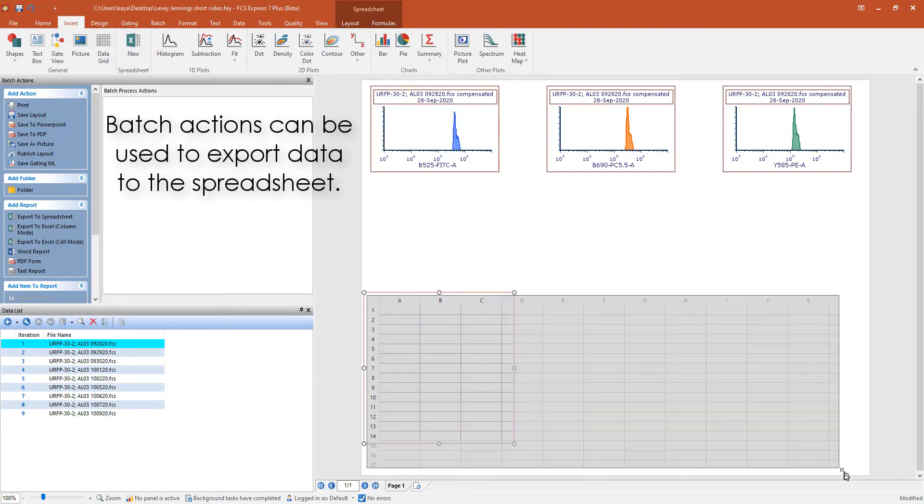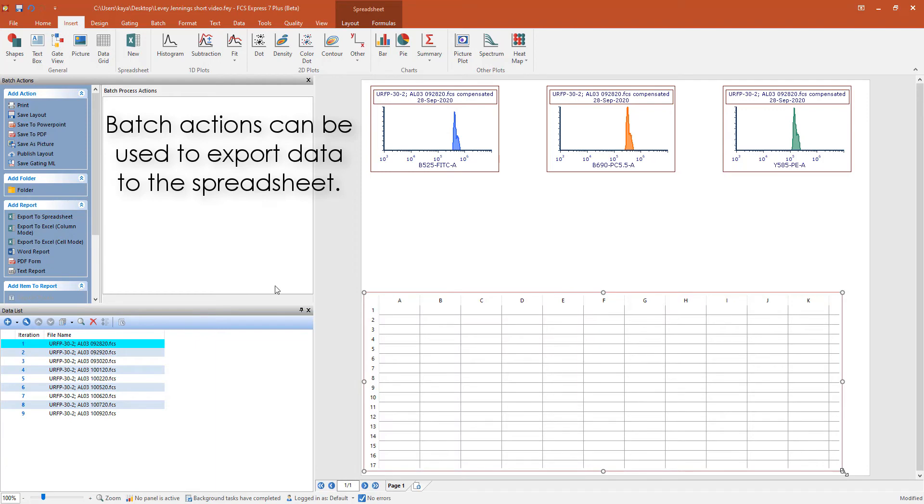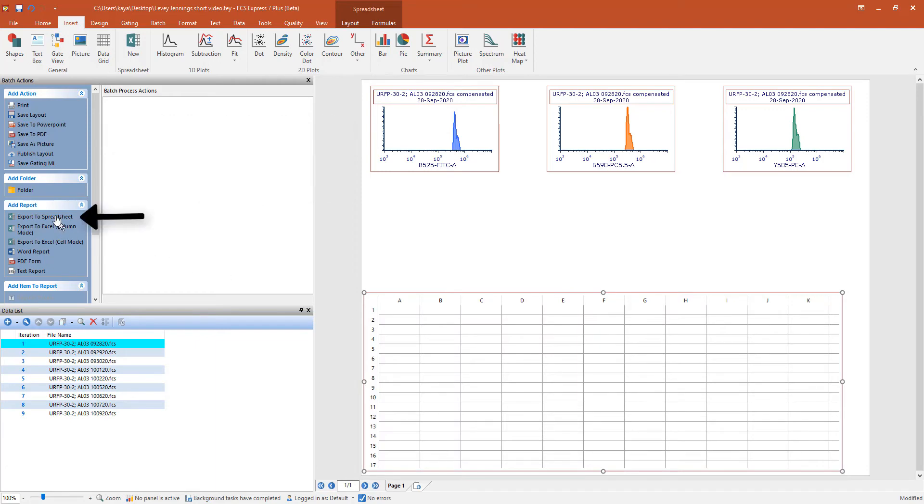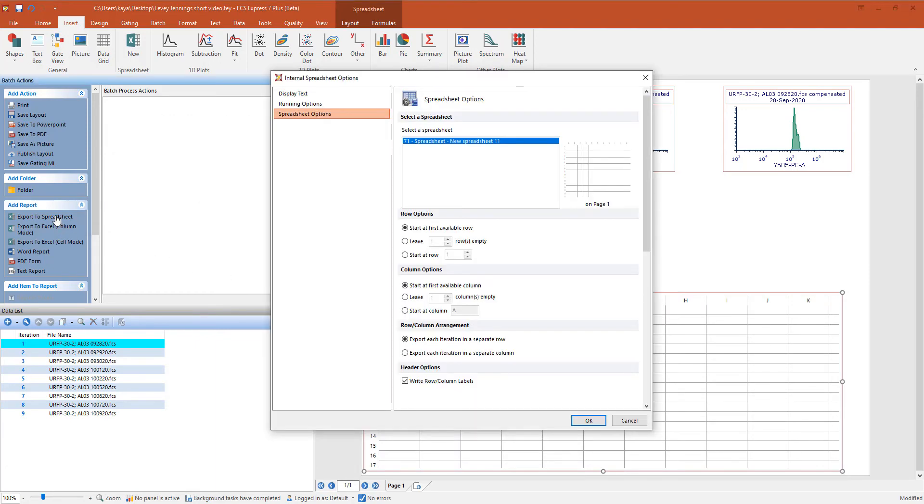From the Batch Actions window, click on Export to Spreadsheet.